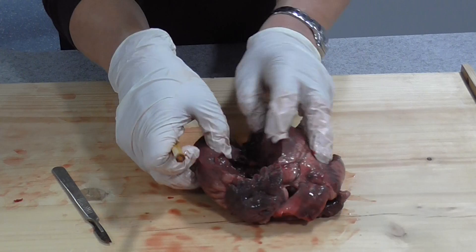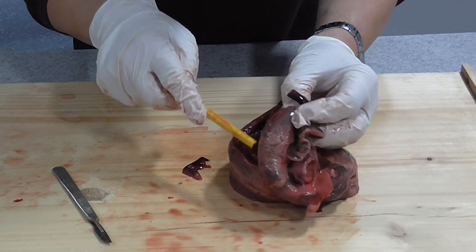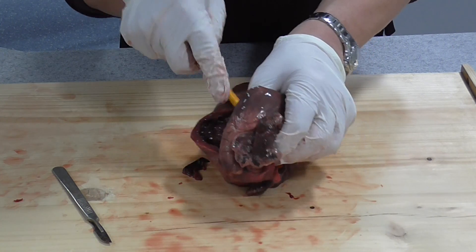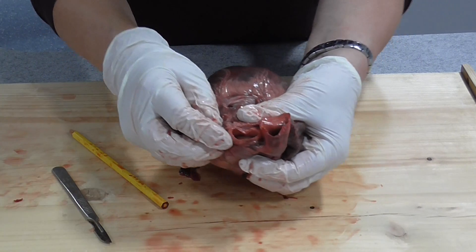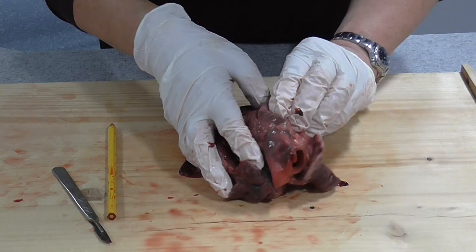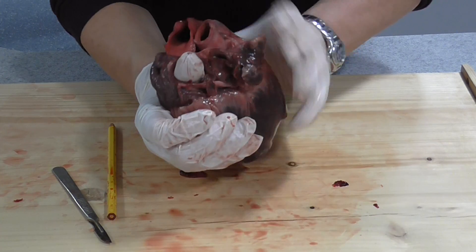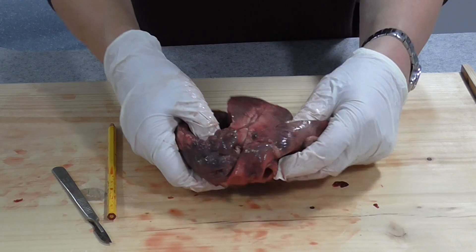Going back to the right side of the heart and doing the same with the pencil, it should come out of the pulmonary artery - the pulmonary artery going out to the lungs, coming from the right ventricle. The other blood vessels we can see at the top: on the right side, leading into the right atrium, is the vena cava - though most of it is missing here. On the left side we have the pulmonary vein, which carries blood back from the lungs into the left atrium.